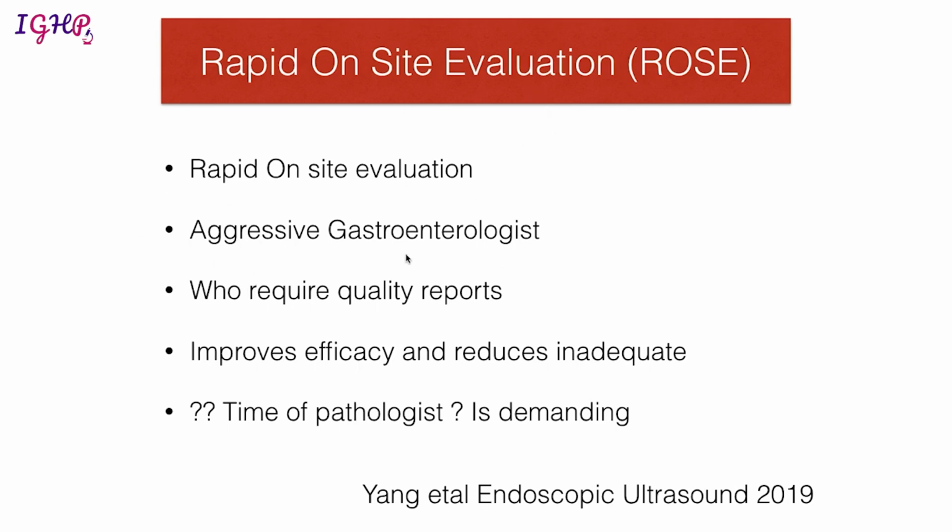It is utilized when the gastroenterologist is very keen and really wants a diagnosis right there in the endoscopy room. It is useful for those who require quality reports, especially because if you tell them that there is a granuloma lying there, they can modify the reports accordingly. So it increases the quality of the endoscopy report that the gastroenterologist is going to give to the patient. It improves the efficacy and reduces the number of inadequate samples.